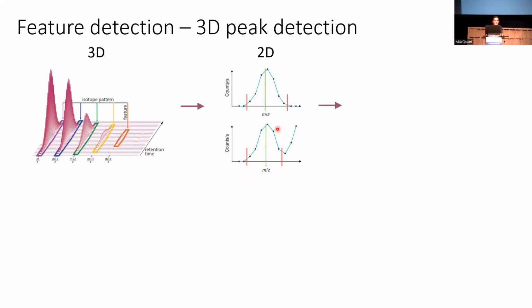And what it will do later, it will logarithmize the data, and then it will fit a parabola. This is almost similar to fitting a Gaussian in the original space. But we're fitting this parabola to the logarithmized space, and this will give us the centroid.